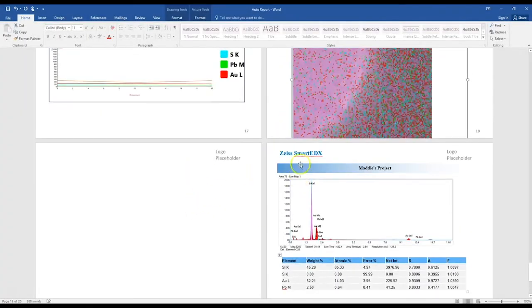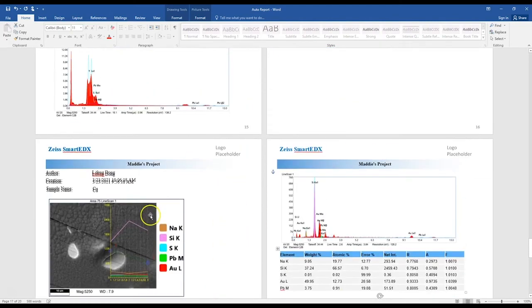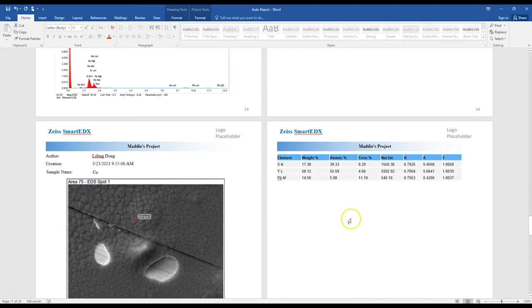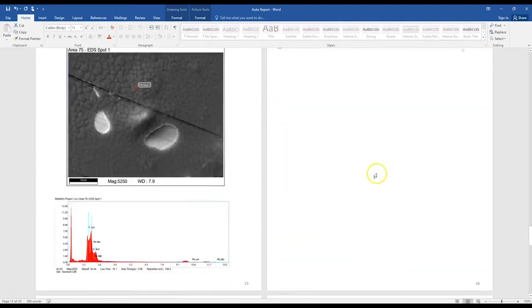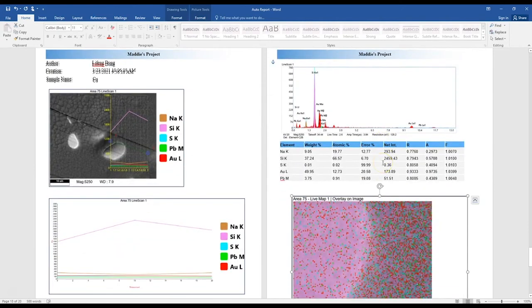This is really helpful to come back to our data later, because sometimes we might not be looking for a specific thing in the moment, but we think of something later that we think would be important to check back at our samples and look at what we have. So all in all, this is a really important feature of the SEM, and we hope that you all get the chance to work with us on it later.